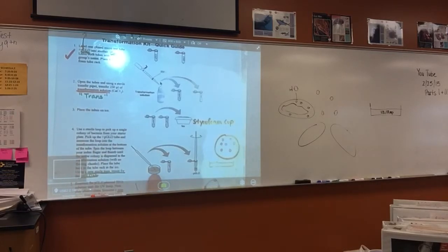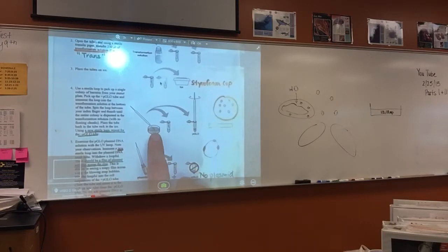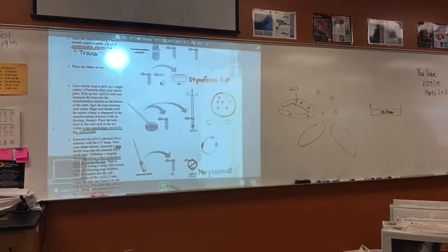So then you're going to get your bacteria. Every group is going to start out with what we call a starter plate. I'm growing bacteria right now that I'll show you before you leave today. And each group will get their own little plate of bacteria. You're going to use a loop. They look like this. You have a whole package of these. And this is another one where you want to make careful note when it says to use a new loop, okay? A new sterile loop. So this is the loop. It looks like a very long, small bubble blower, with the loop at the end. That's what it looks like, okay?